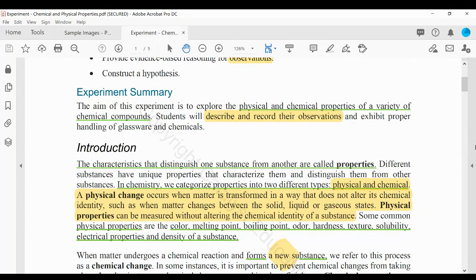After 10 minutes, when you mix that colorless solution with a piece of copper, you start to see that the surface of the copper changed to a silver color. And the solution that was colorless is now light blue. So what happened? That is when you are going to start guessing.